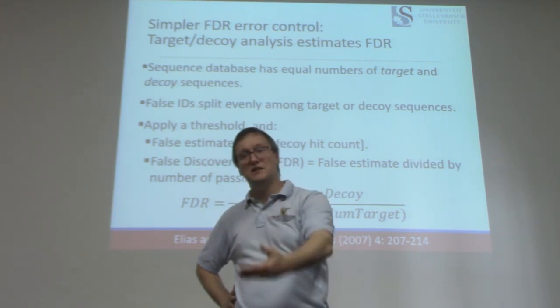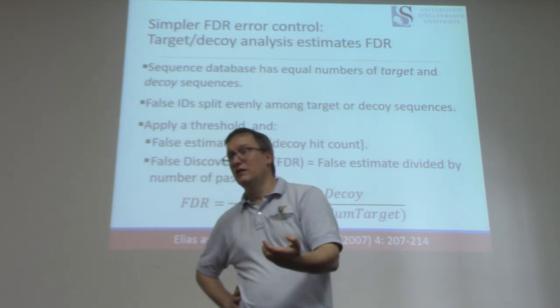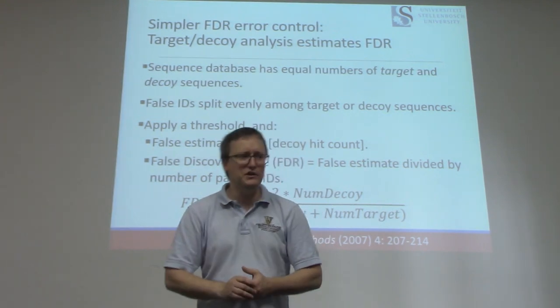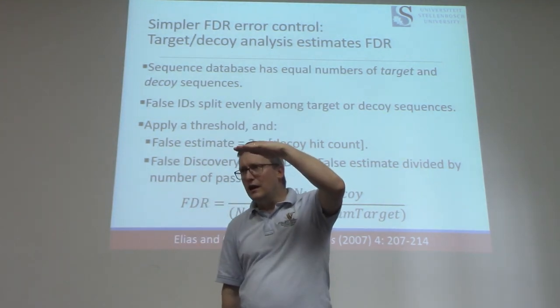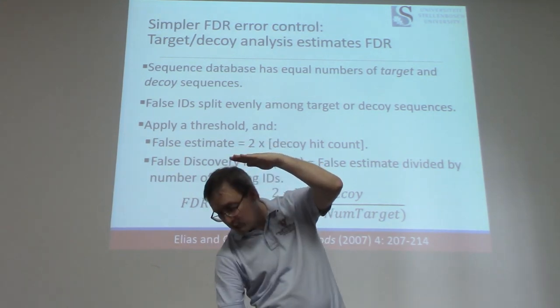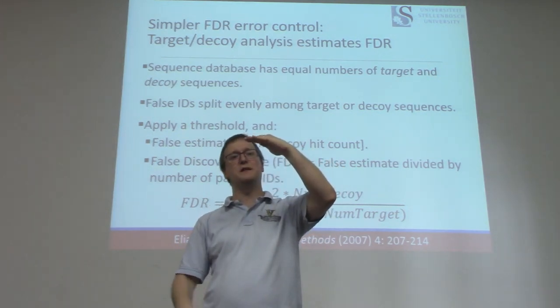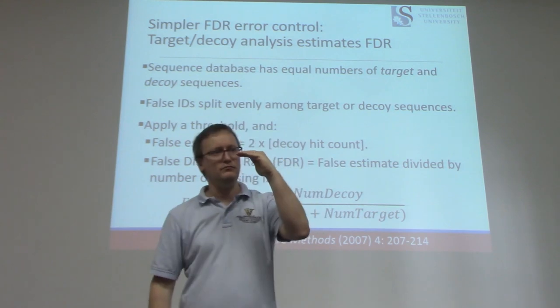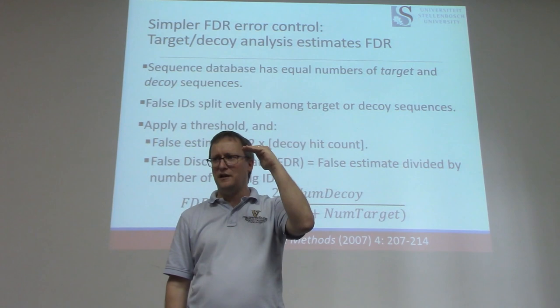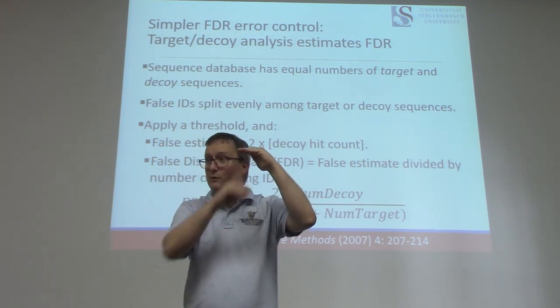So when a spectrum is assigned to a peptide that only occurs in a false protein, you know that one is false, and you can see what score it received. I want you to imagine that under my hand, I have my list of all spectra from the very highest scoring in the database search to the ones that got the very worst score. They're down on the floor. So I've sorted this whole pile of PSMs now from best to worst. Where would you assume that the falsely identified peptides are? Are they right up here touching my fingers?